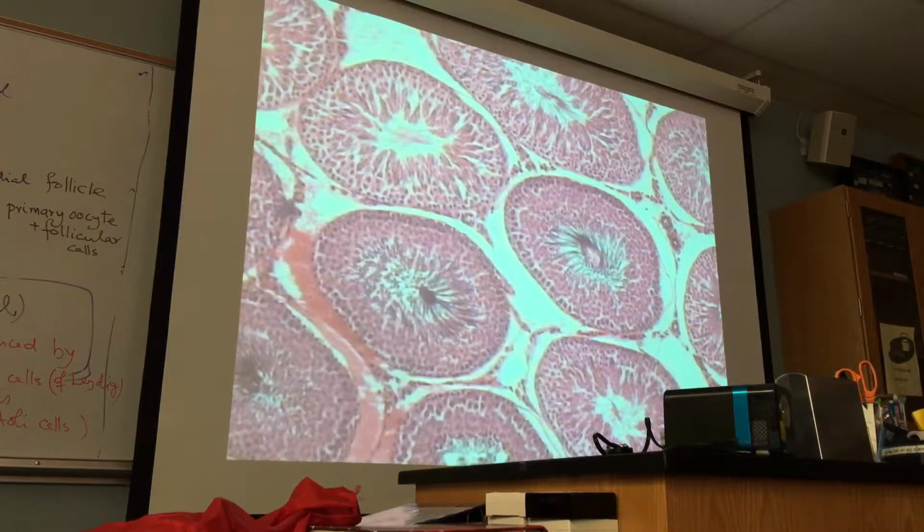The stem cell that ultimately gives rise to sperm is called spermatogonium. Spermatogonium is singular, spermatogonia plural.